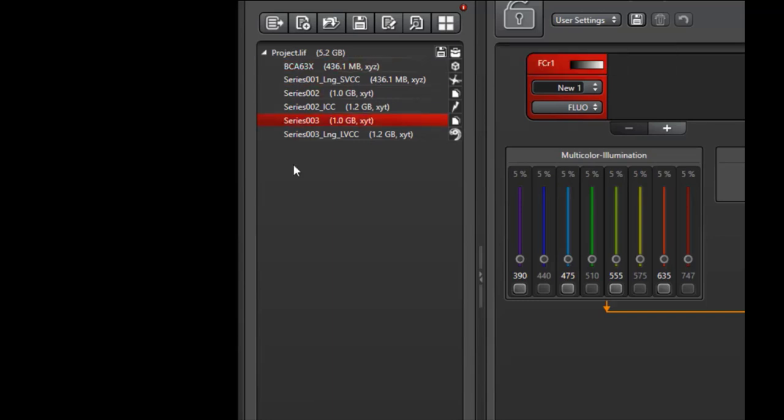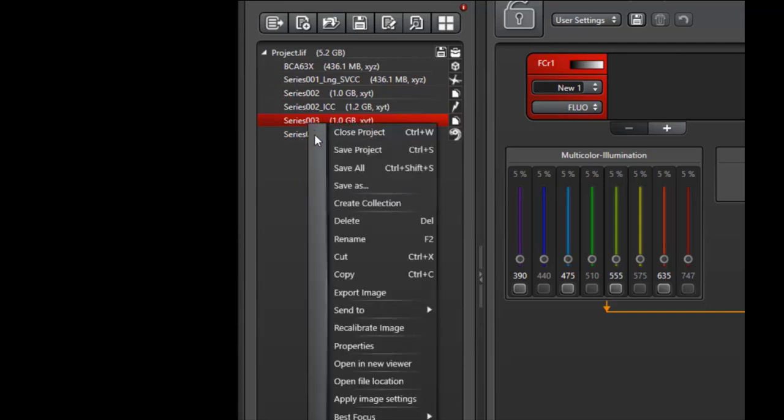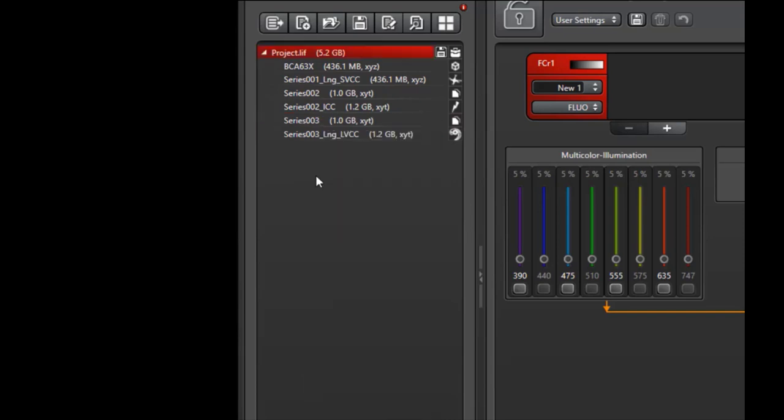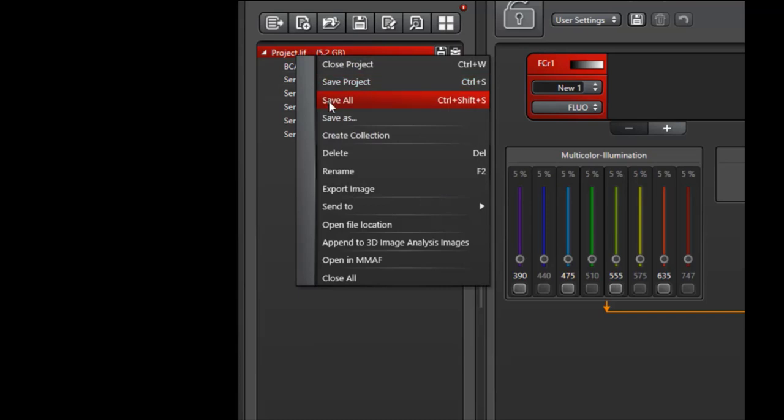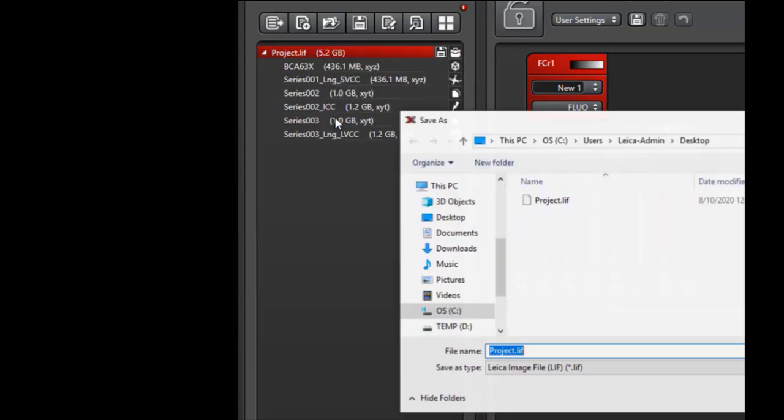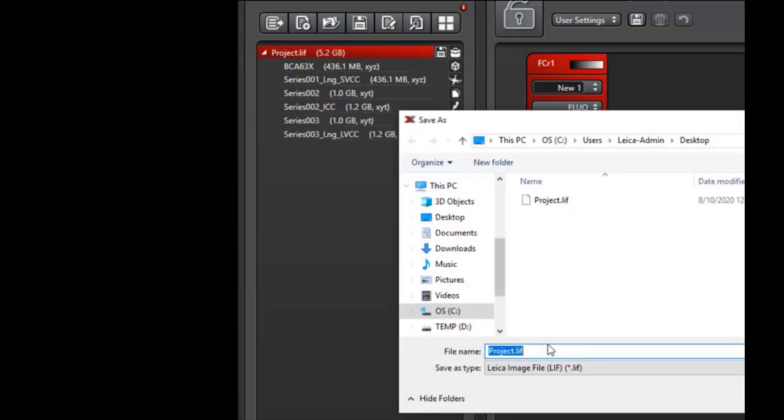I've also identified series 003 wasn't representative and can be deleted. For that, you can right-click and delete. The last thing I'll do is save this project by right-clicking, saving as, and give it a specific name that I can easily reference at a later date. I'll call it JD 0810 2020.